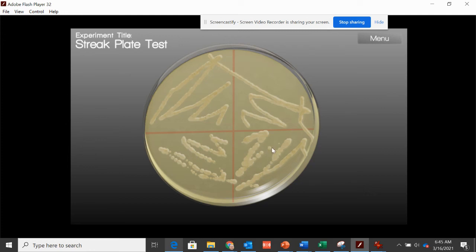We might want to plate this thing again, maybe on a different type of agar that grows certain types of bacteria. There are all kinds of them we'll learn about in class and that you'll do a virtual lab on. I might want to say, well, I know it's sort of this yellowish beige bacteria that grows in little circles, but we've got to figure out what's going on. So we can grow it on different media, we can stain it. We would want to pull from one of these little isolated colony circles when it comes time to do any testing. We can guarantee that's one species of bacteria. We can't necessarily guarantee that this is one species. It could be a bunch clustered together. That's how you do those.